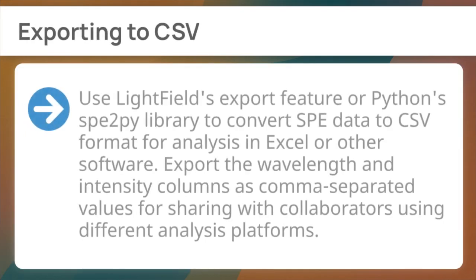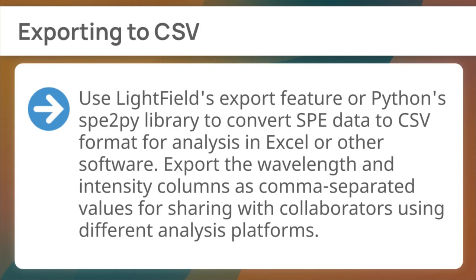Finally, exporting to CSV. Use LightField's export feature or Python's SPE2PY library to convert SPE data to CSV format for analysis in Excel or other software. Export the wavelength and intensity columns as comma-separated values for sharing with collaborators using different analysis platforms.